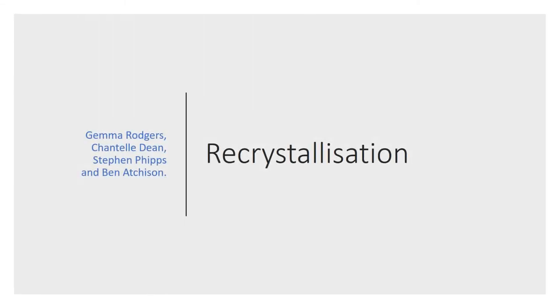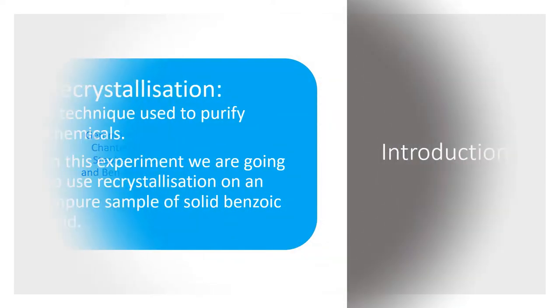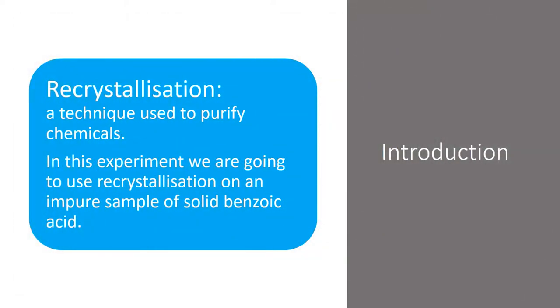Recrystallisation is a technique used to purify chemicals. In this experiment, we are going to use recrystallisation on an impure sample of solid benzoic acid.